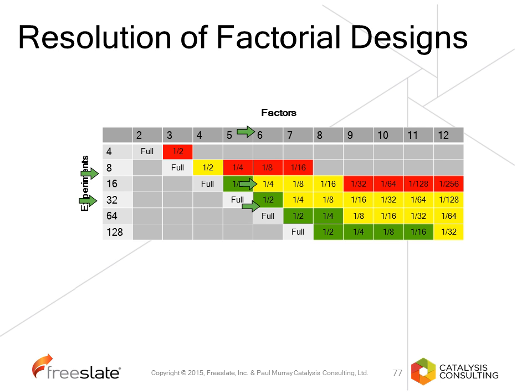The problem with the resolution 4 design is that you may have 2 or more interactions which are confused. So you've not carried out enough experiments to be able to pull apart all of those interactions, but the software will tell you which interactions it could be.